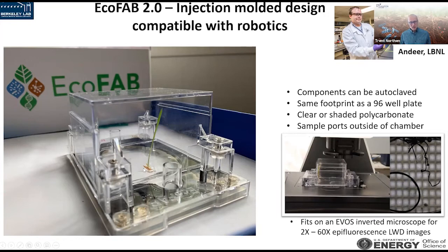It has a microscope slide at the bottom, and then a root chamber, and it has 2 sampling ports that we put septa over, so we can have gas tight sampling, or we can put covers on them that we can remove easily for exudate sampling, changing the media, etc. Then we have this sterile chamber in here. It's kind of like a petri dish lid sitting on the top.